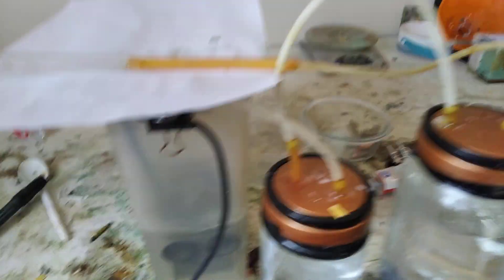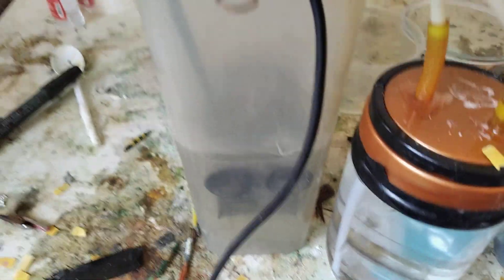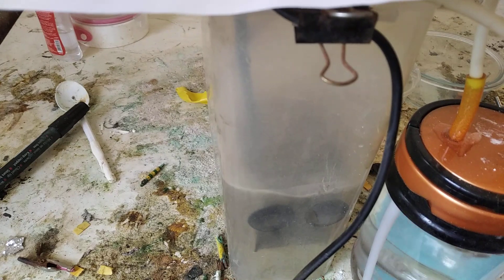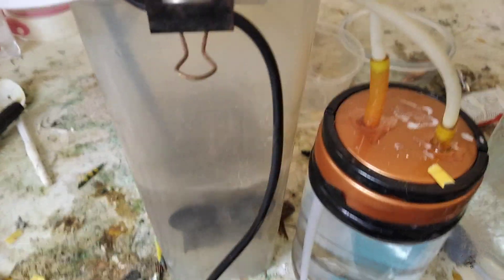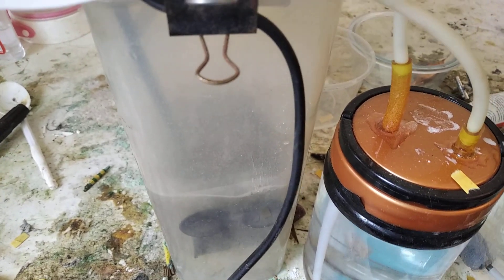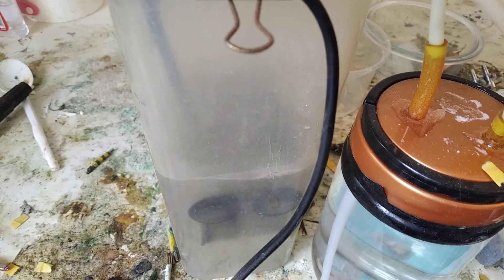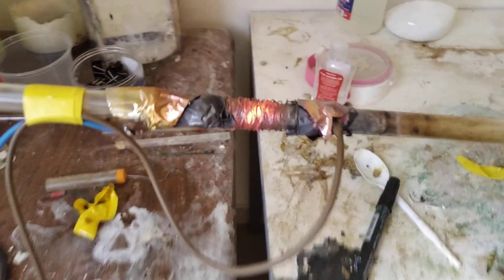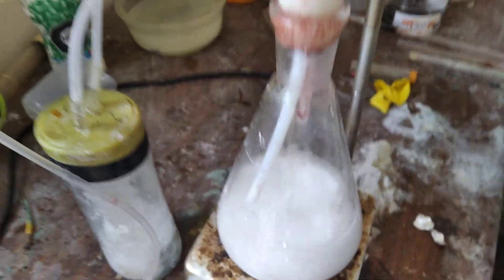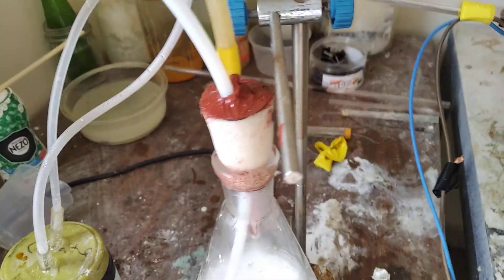And we have our venturi scrubber. Our venturi scrubber is not looking brown, so that's good. This venturi scrubber is filled with sodium hydroxide and baking soda. What it's doing is not only scrubbing the fluids, it is also keeping the pressure drop of the system manageable because in this reaction chamber, this catalyst is that tightly packed.